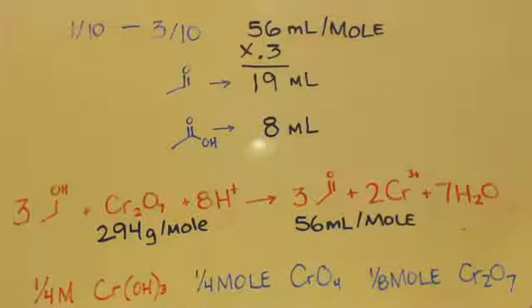That isn't that much, but you have to think about it that you can recycle this stuff and just use it over and over. I bought 2 moles of chromium, and I'm thinking that could last me the rest of my life if I recycle it. If I use a tenth of a mole for each, I actually would like to use a quarter mole, but the weight is just, I mean, almost 300 grams per mole. That's ridiculous for a molar mass.